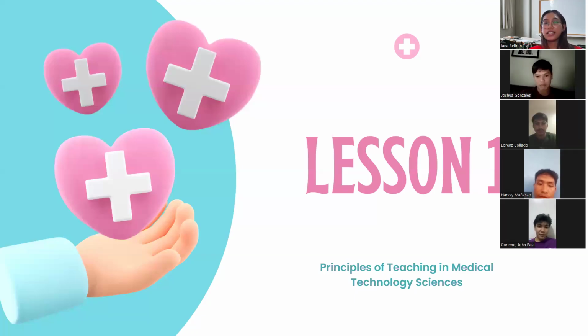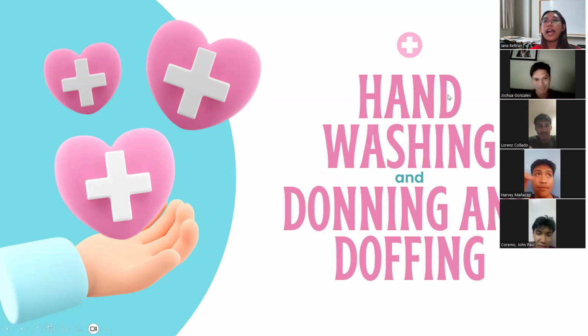Good afternoon, class. I am your teacher for the subject Principles of Teaching in Medical Technology Sciences. I am Miss Beltran, and today we will be having our first lesson. Our first lesson would be hand washing and donning and doffing.